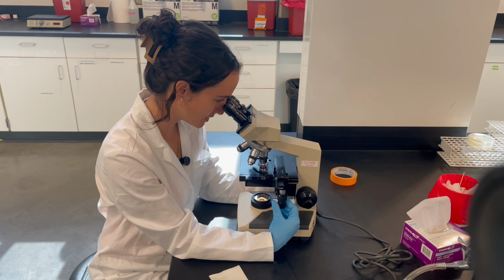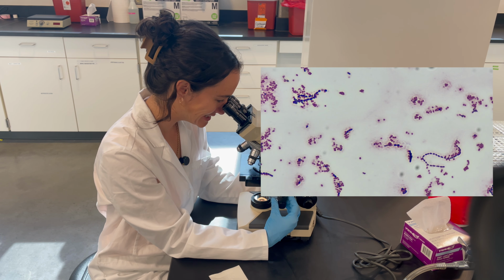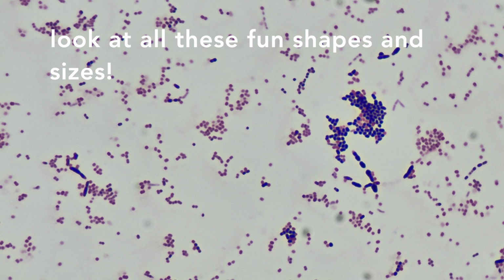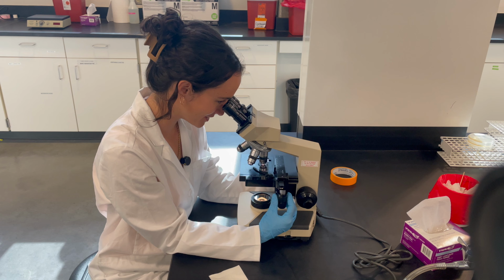Interesting. So we did a gram stain on this stuff in my mouth, and this is cool. I'm seeing some really obvious Streptococcus microbes, and then it looks like some of the yeast got cut up in that gram stain because we have some irregular patterned little dudes. Okay, this is fun. Oh, and some bacillus-shaped microbes. We got a little bit of everything going on here.